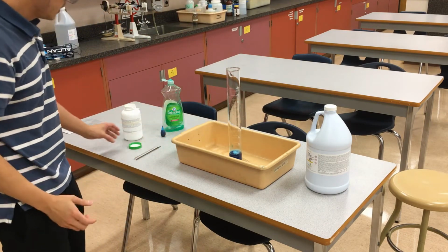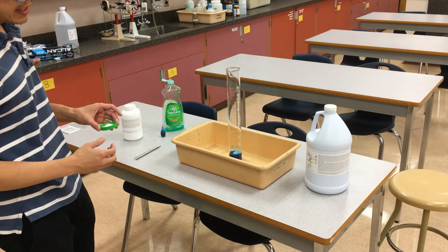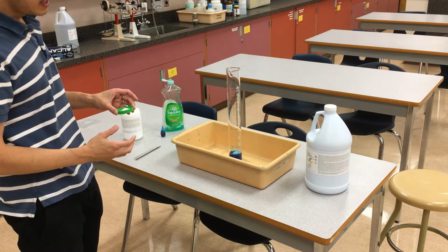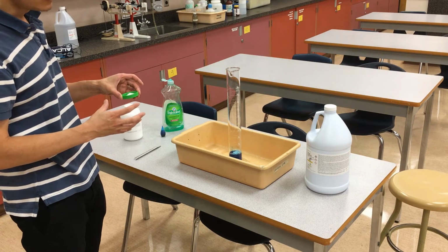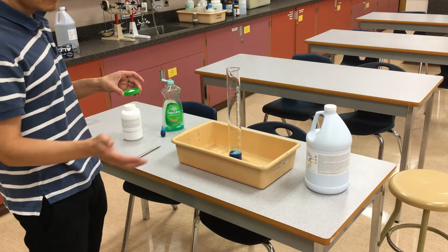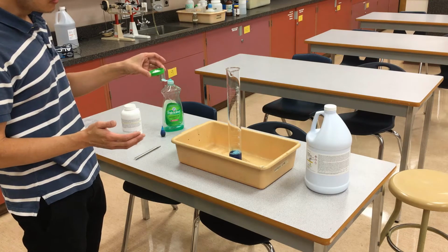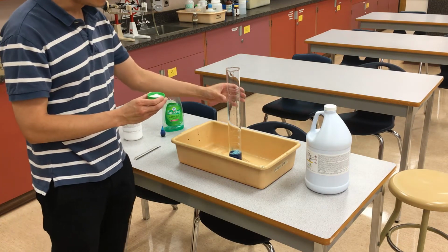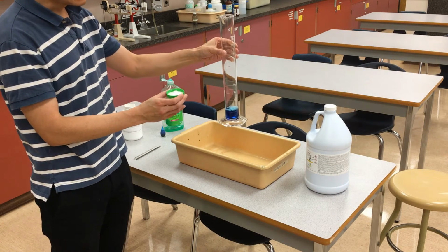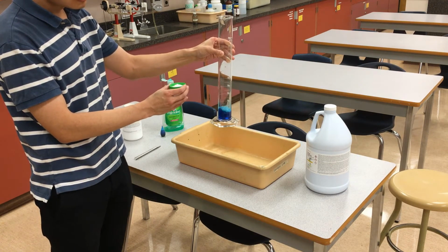Still too slow. The third chemical I'm going to add is called potassium iodide. In grade 12, we're going to learn the actual mechanism of this. Potassium iodide allows the reaction to occur via an easier pathway. The second that I drop this in, I'm going to hold it up as long as I can. You'll see in a second why I need to drop it, but we're going to have potassium iodide catalyzing the decomposition of hydrogen peroxide.